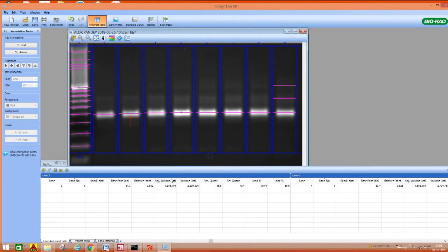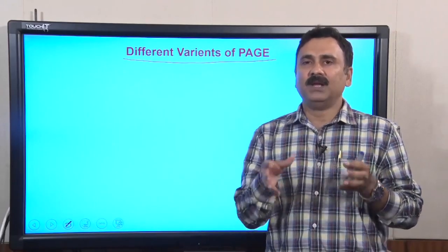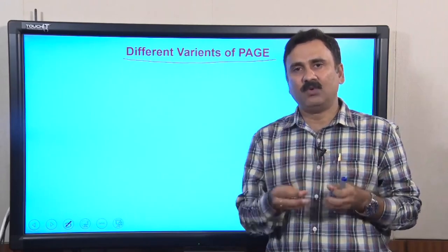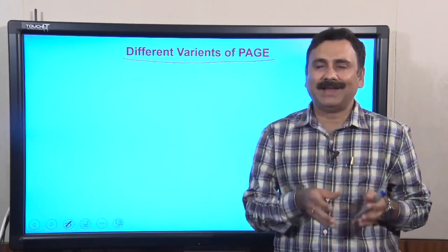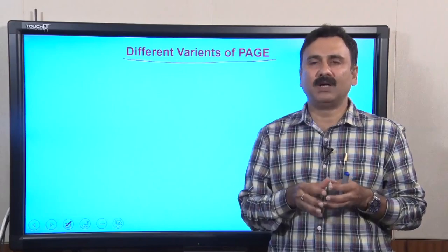So I hope this software information part helps you to understand how software can be utilized for analysis of different bands and molecular weight purpose or quantification purpose. In this clip we have discussed all the steps and I hope this image analysis demo could be useful for you to analyze your protein gel samples, as well as it may help you in advancing your work. Thank you.